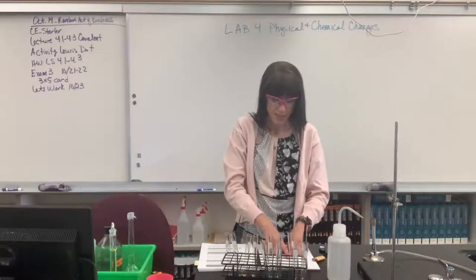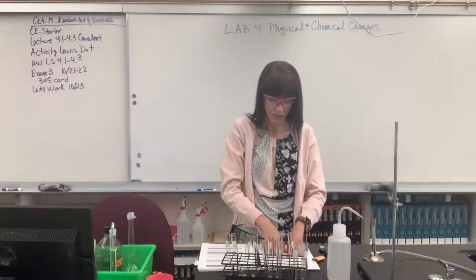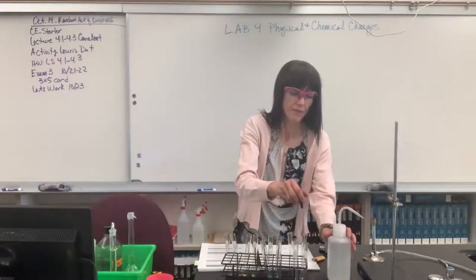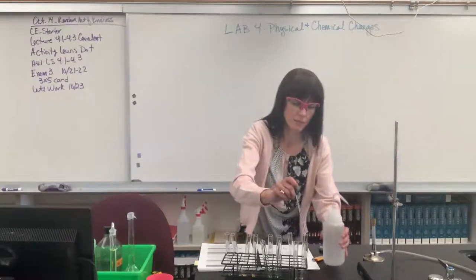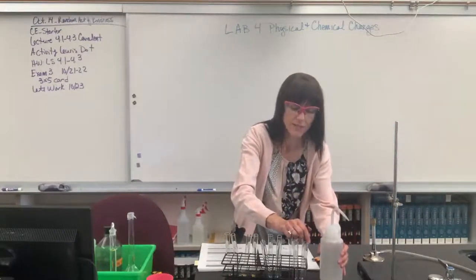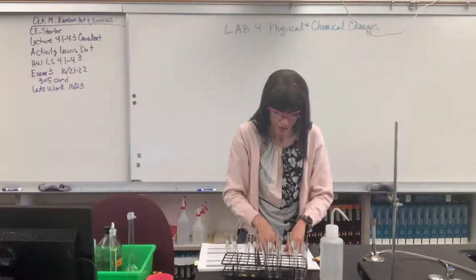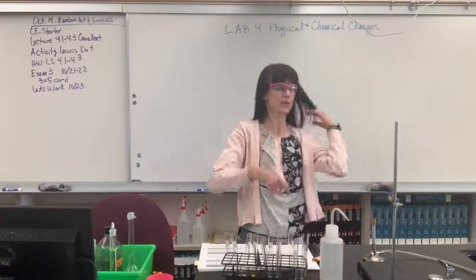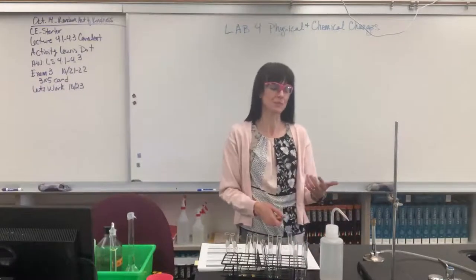And then it says, test the sample in one tube as follows. Moisten the end of a clean stirring rod with distilled water. So I've done that. I'm going to wet my stirring rod and then I'm dipping it in one of the test tubes. Then it says, put the stirring rod with salt crystals in the flame of your burner. I have a Bunsen burner right here. So we're going to start the Bunsen burner. We haven't got to do this before.